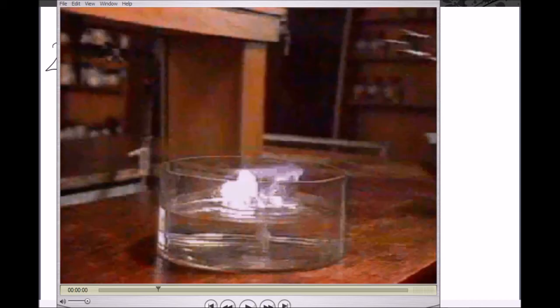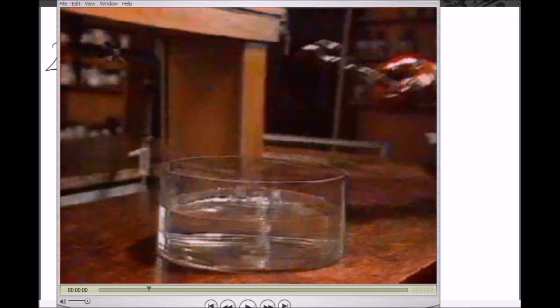One thing I want you to have a look at is what happens to the cesium as soon as it's put into the water, and you can maybe see it on my cursor there now, and that it sinks, so it doesn't float anymore unlike the other group 1 metals, and that's a sign that as you go down the group, density increases. So you can see loads of fizzing. It's just about, see it maybe on the screen, that it fizzes rapidly and it's really exploding.